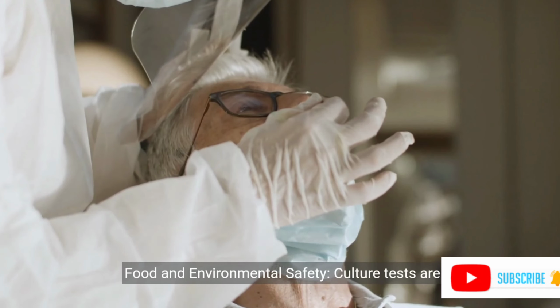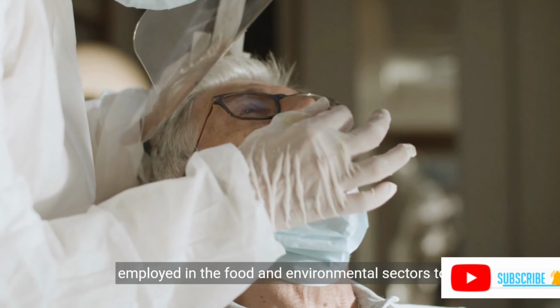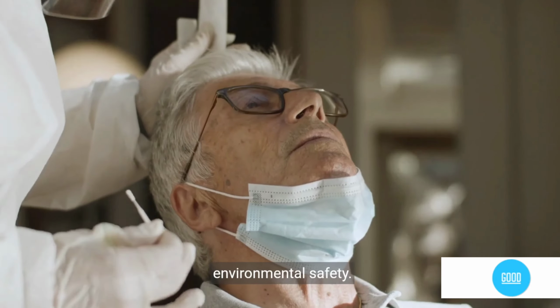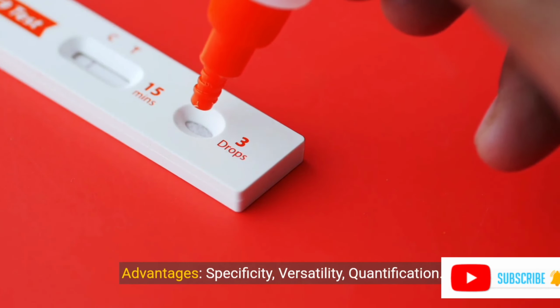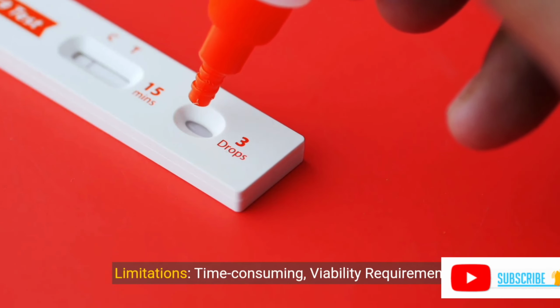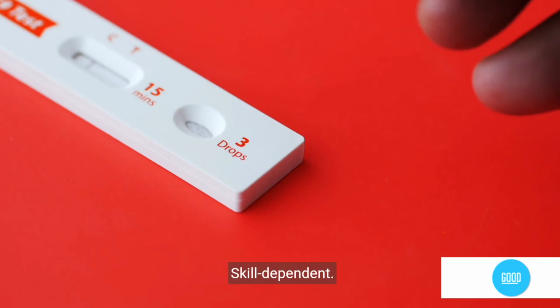Food and environmental safety. Culture tests are employed in the food and environmental sectors to detect pathogens, monitor water quality, and assess environmental safety. Advantages and limitations. Advantages: specificity, versatility, quantification. Limitations: time-consuming, viability requirement, skill-dependent.